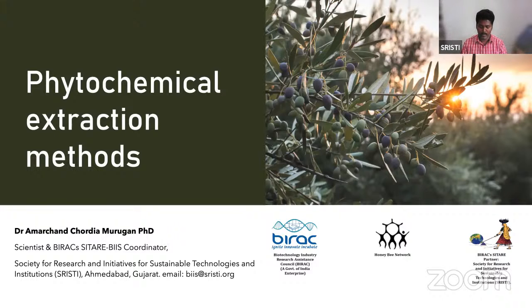So screening, although different methods are involved, a lot of methods are involved in the extraction process. Choosing the correct method determines your next step in your experimental process. So if you are not choosing the correct method to extract a particular compound, molecule, biomolecule, then your further research studies, experiments will be affected by that. So always be critical while designing your research proposal. Choose methods which are more suitable for the compounds you are wishing to isolate and study. Okay.